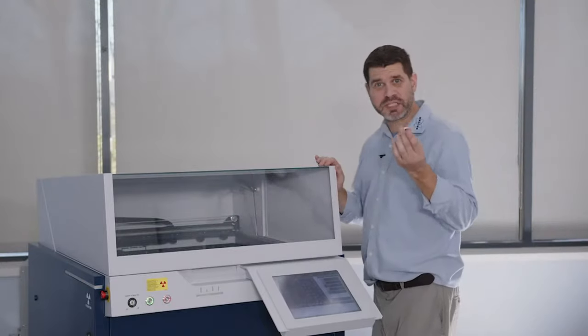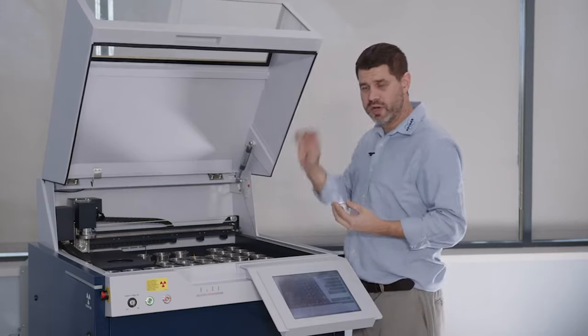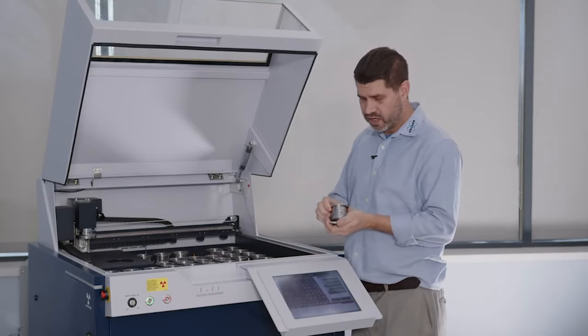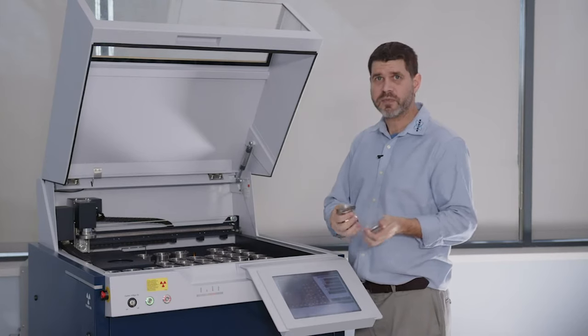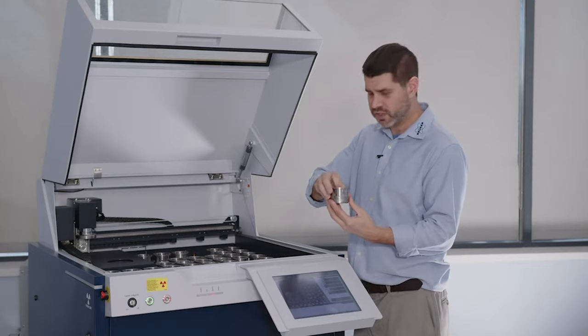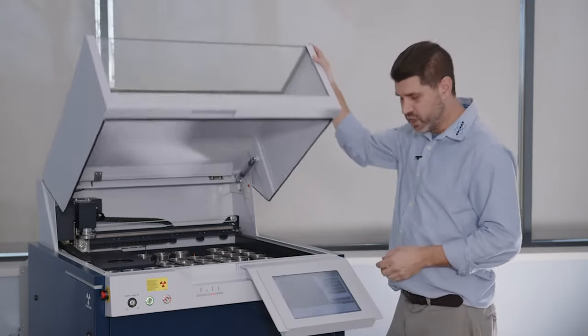All right, I brought the pressed pellet sample with me, and we're back here in the lab. What we're gonna do now is show you how easy it is to run a sample by XRF. So what I'm gonna do is take the sample that we prepared, put it into the cup, close it, and then we're just gonna put it into the position.